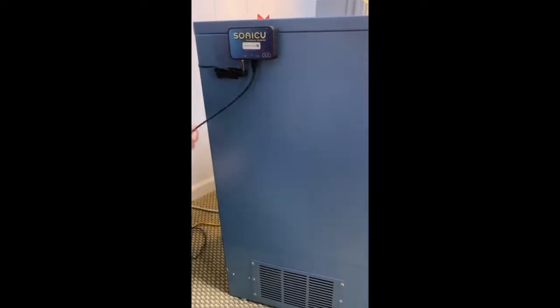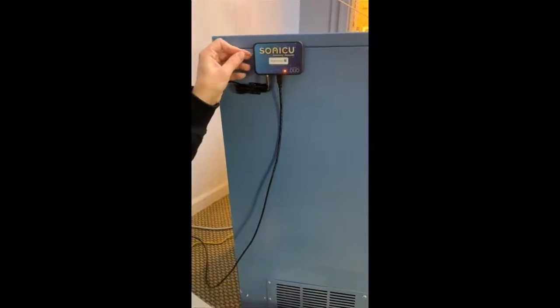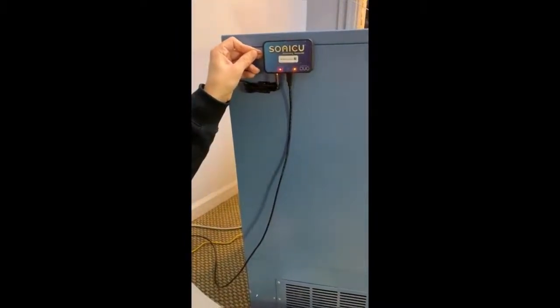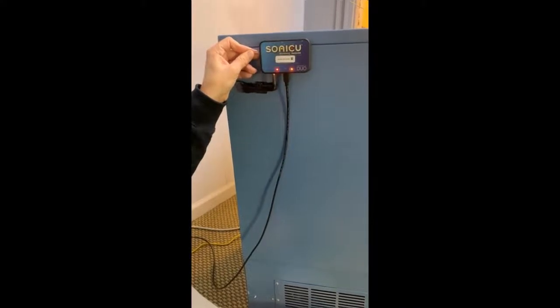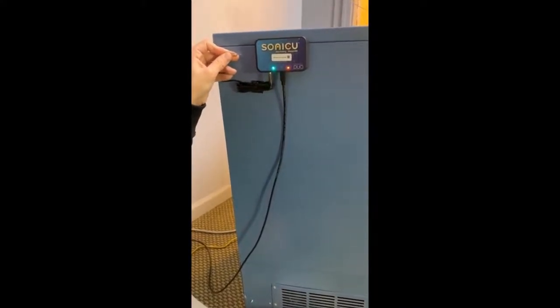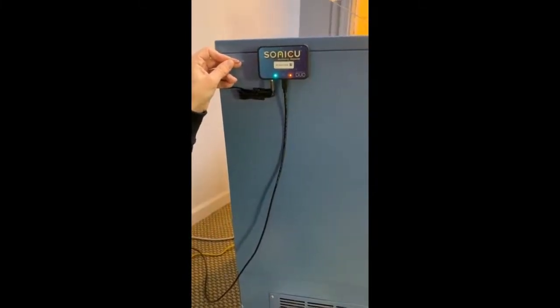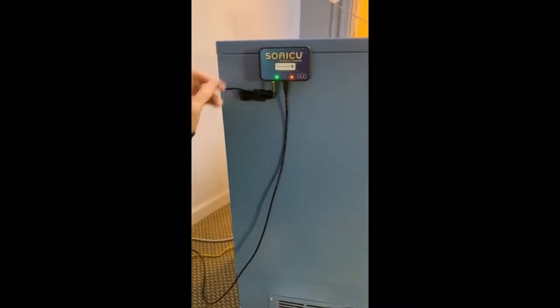An orange light will appear when the meter is powered. Turn the meter on by using the included reset pin — hold the on/off transmit button down until the LED on the front left side flashes green, then release the button. The LED will start flashing in accordance with the SoniShield Duo's signal.